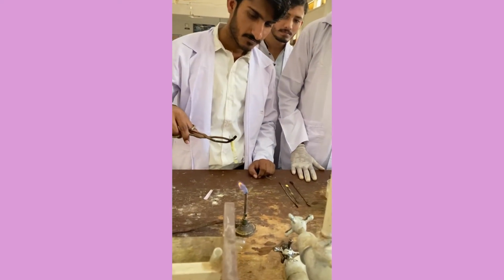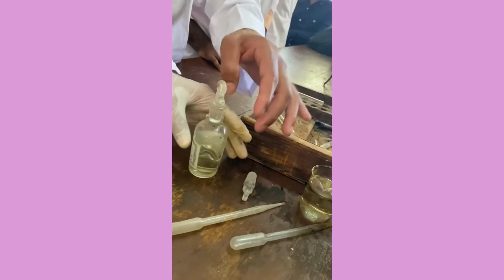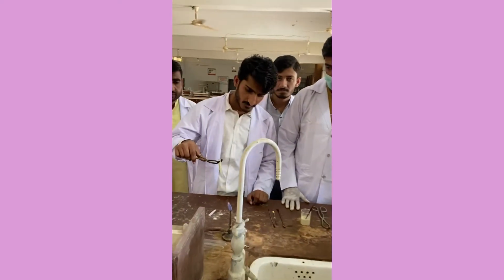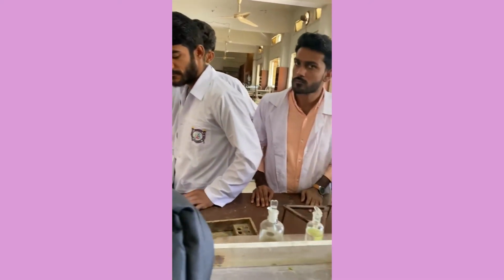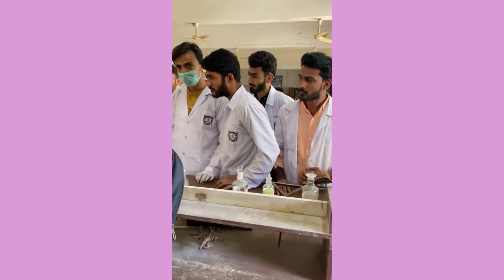Which solvent are you using for the solubility? Dilute HCl. And what is this? This is concentrated HCl. Okay. Great. It's insoluble in concentrated HCl. Just record your results. You have not done the second step up till now? The girls are doing it. Okay, fine. So it's a non-nitrogenous compound, it doesn't contain nitrogen.